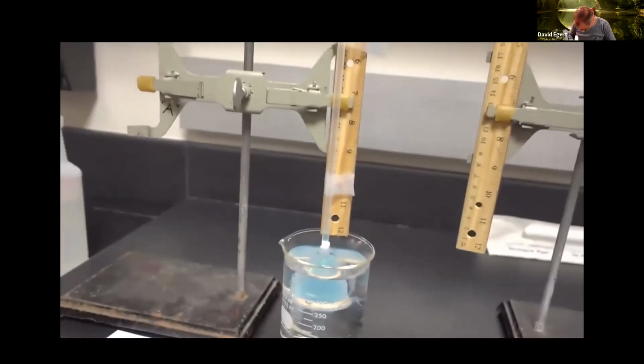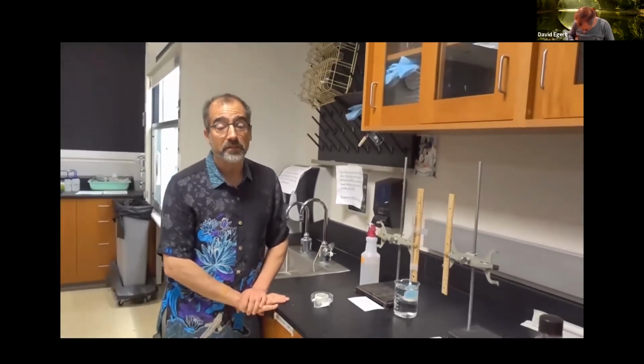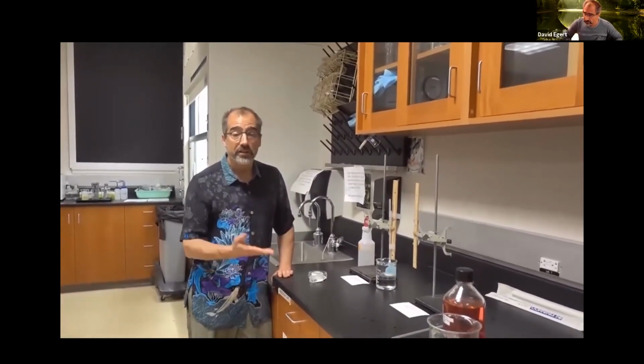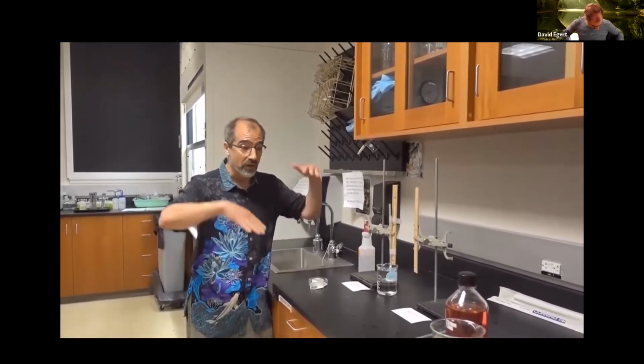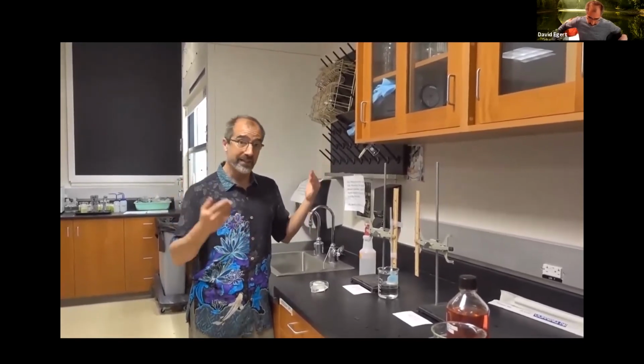So that's going to make it really easy to measure rate, as Tina was saying earlier. Rate is going to be the distance divided by the time. So for any 10-minute segment, you can measure a rate for that particular 10-minute segment. You can say, in that 10 minutes, how far did it move? And divide that by 10 minutes, and it can give you millimeters per minute.